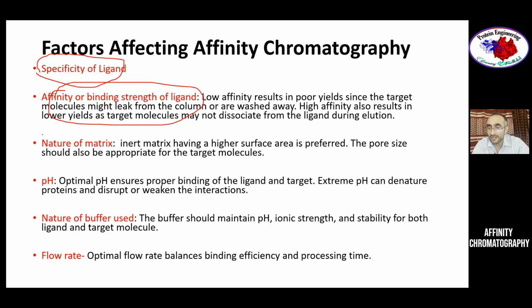The nature of the matrix must be inert, and generally it should not interact with any other analyte. For example, say you are using agarose beads. If you are purifying proteins from a mixture of proteins, and you have some protein which can bind to sugar, those may bind to the agarose, and then you may need another step to purify. It may not be a single step purification.